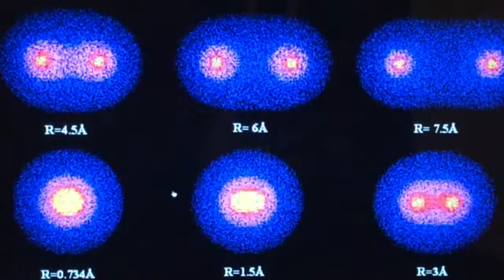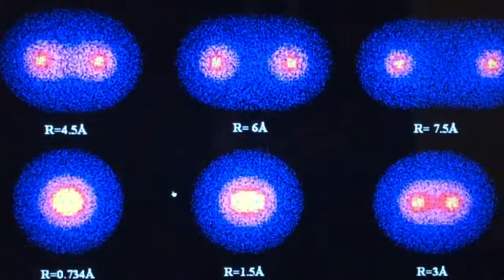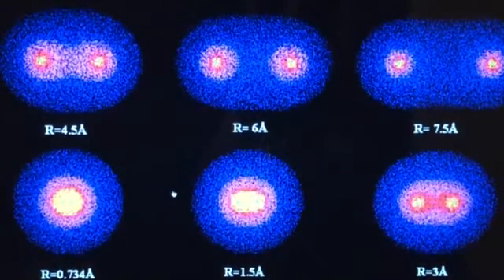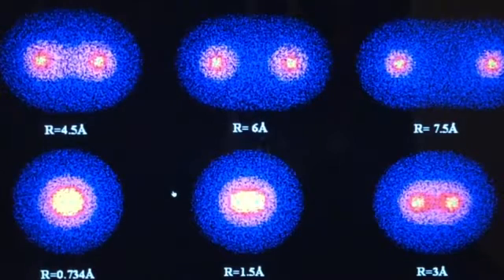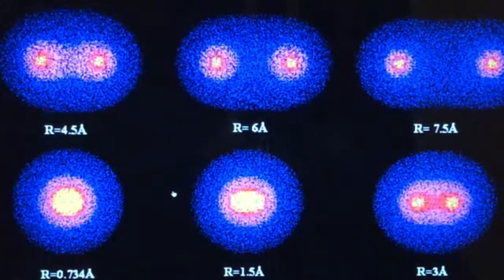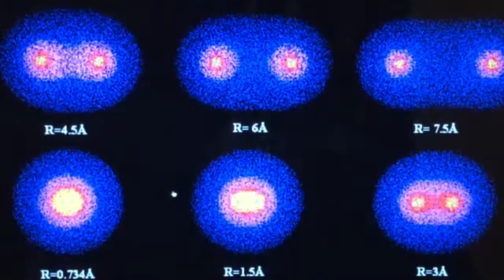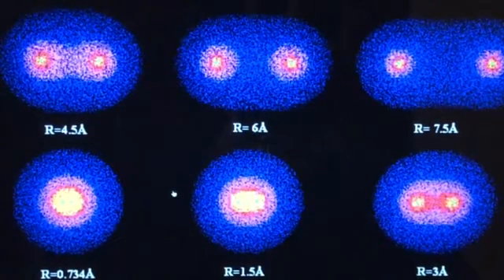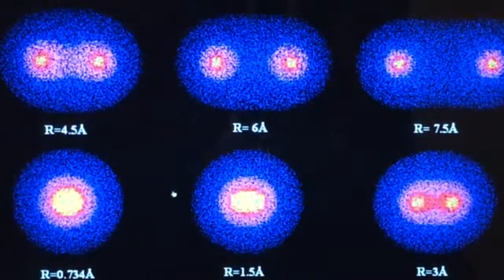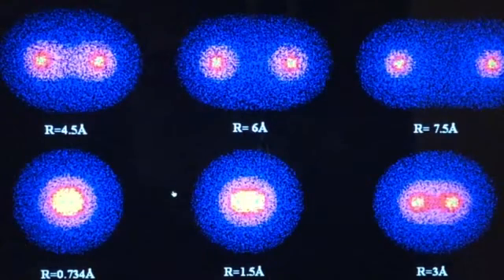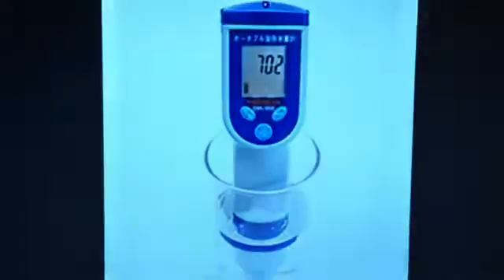Today I'm going to show you how to measure hydrogen correctly. This is important because two of the most important things nobody seems to be talking about are: one, how to make hydrogen safely and correctly, and two, how to measure it correctly.